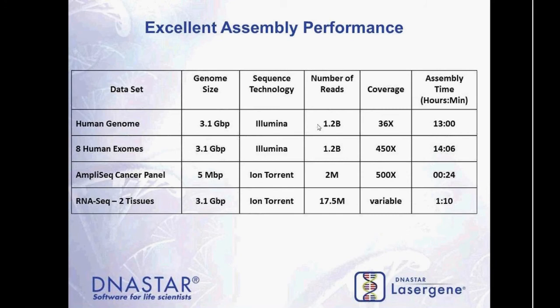And here, too, I do want to point out that when I talk about assembly time, this is really the assembly, gapping, statistical SNP calling and filtering, and writing out all of the output files for your project. So it's not just the mapping time, but rather the entire process from pressing start to having a completed BAM file at the end of the assembly.